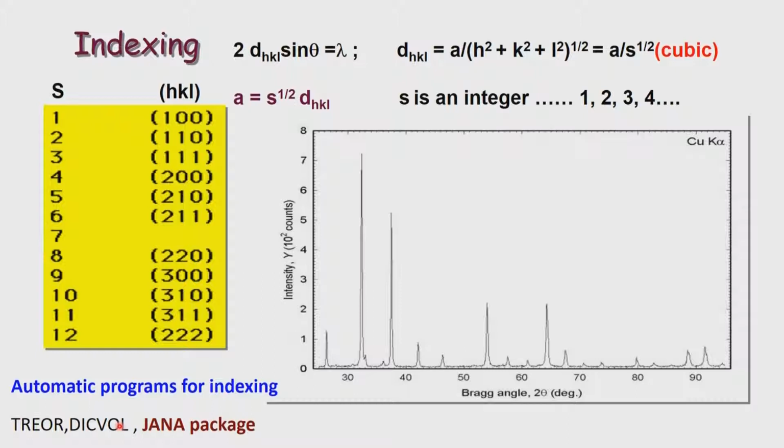The best package that can be used for every purpose, starting from indexing the powder diffraction to structure solution, is EXPO, and this package is again downloadable free, and can be accessed through the web. So, these are the programs which will automatically index a given pattern.